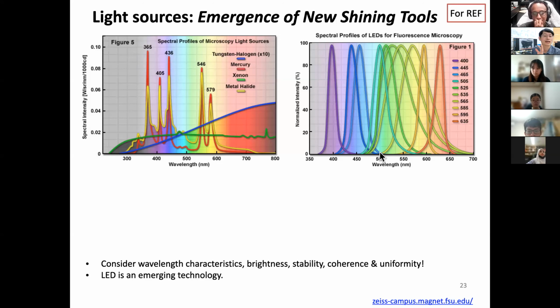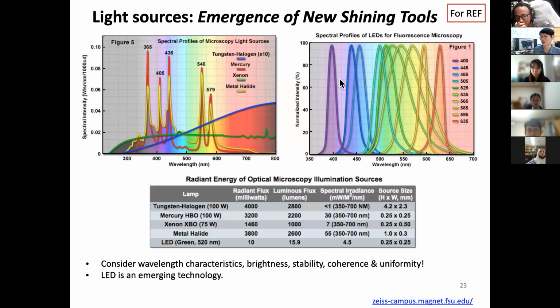In that case, you need to have multiple kinds of LEDs. Even though a single LED is cheap, you need multiple LEDs and you have to control them. That part makes it a little more expensive. So that's what you have to know. However, it's very durable, okay?